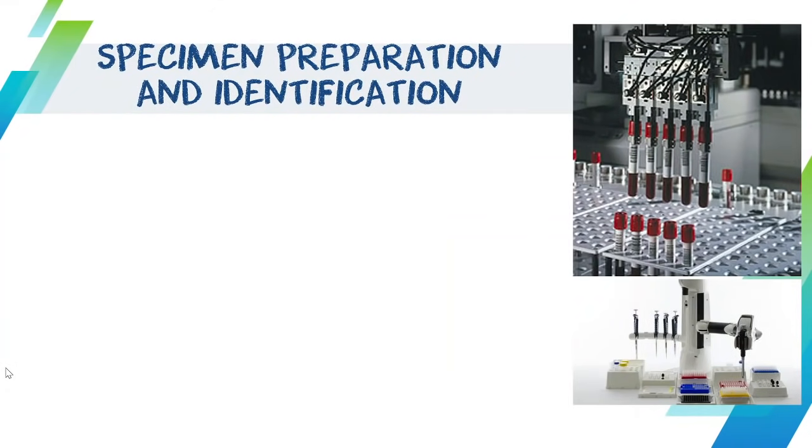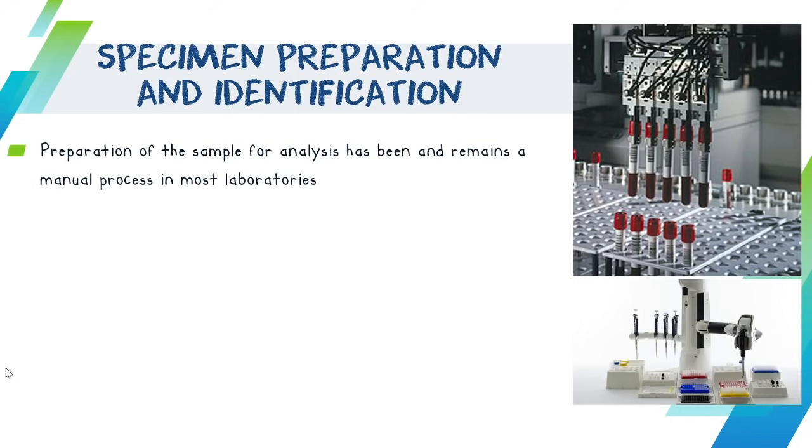So let's proceed to the next step. Rather, sorry. So, preparation of your sample for analysis has been and remains a manual process in most laboratories, which is true. Actually, kani magong specimen preparation and identification, if tan-awon jud ninyo medyo lisod man gyud kay ni siya i-automate, and if gusto nato siya i-automate, then that is an additional na cost na pod.